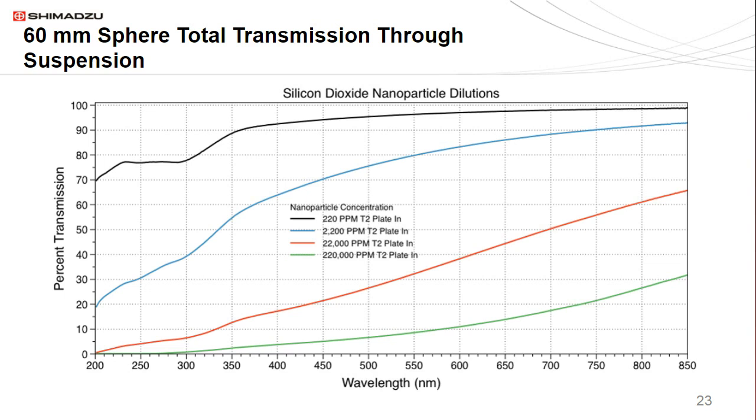What's clear is that we seem to be suppressing the peak structure below 350 nanometers as we go to higher concentrations, but are we suppressing out useful information? Just by looking at the scatter transmission spectra may show us when we have too much, but it doesn't necessarily allow us to pinpoint the nanoparticle suspension that might be optimal for analysis.